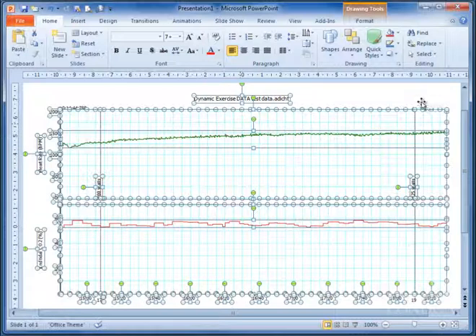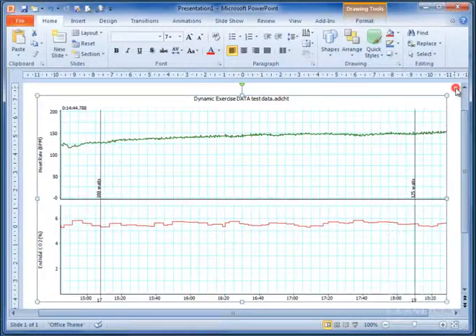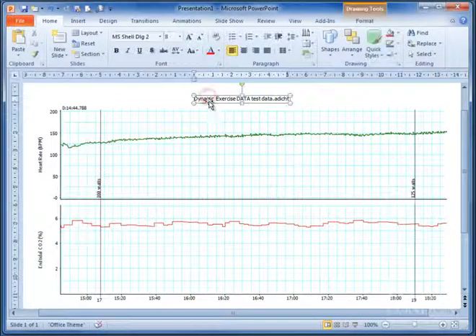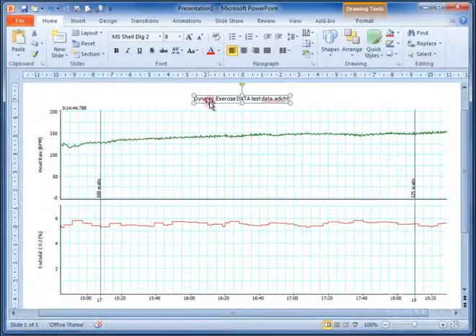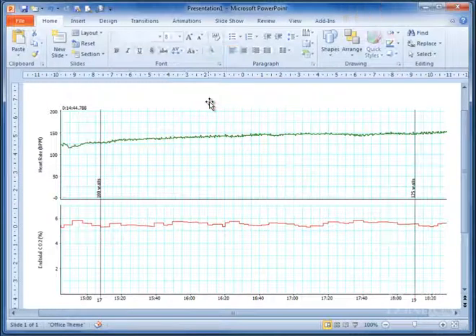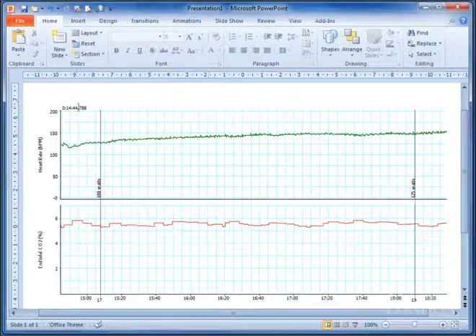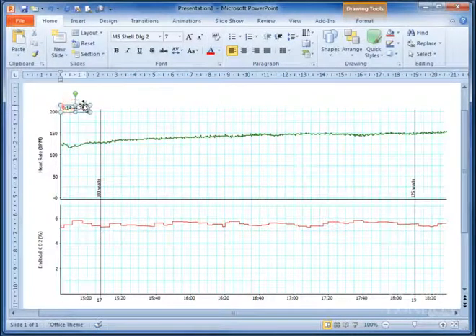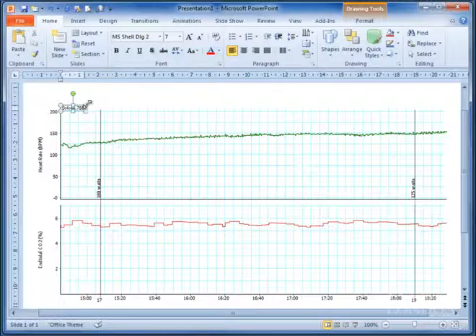Okay? Now we can edit all of this. So let's just have a little look and see what we don't want. We don't want that. So we can click on that, and we can delete it. We don't really want this point up here. So we can click on that, and we can delete it.